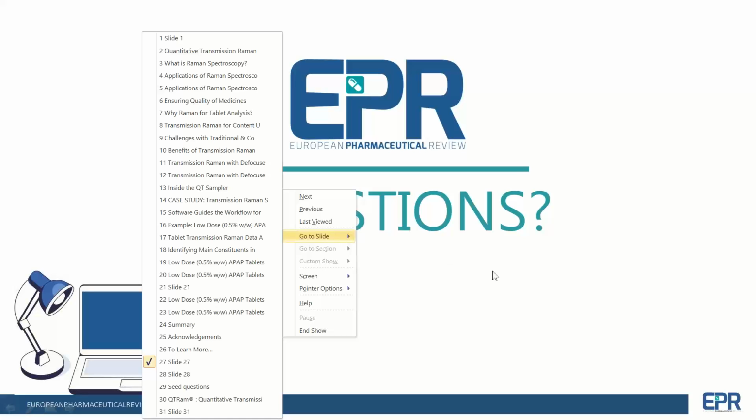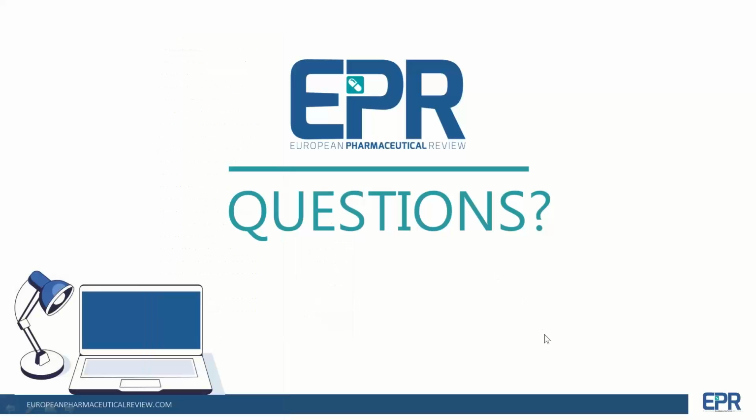Lovely, thank you. And our next question, is transmission Raman spectroscopy accepted for pharmaceutical final product testing? Yes, it is accepted, and there have been companies that have been developing and using transmission Raman spectroscopy in that manner as final release. Great, thank you for clarifying.